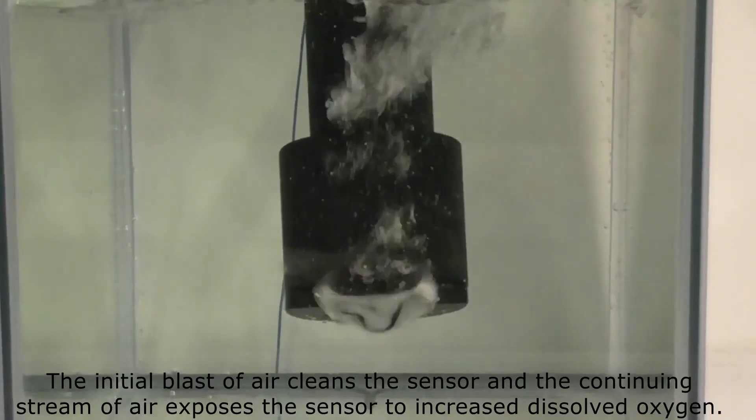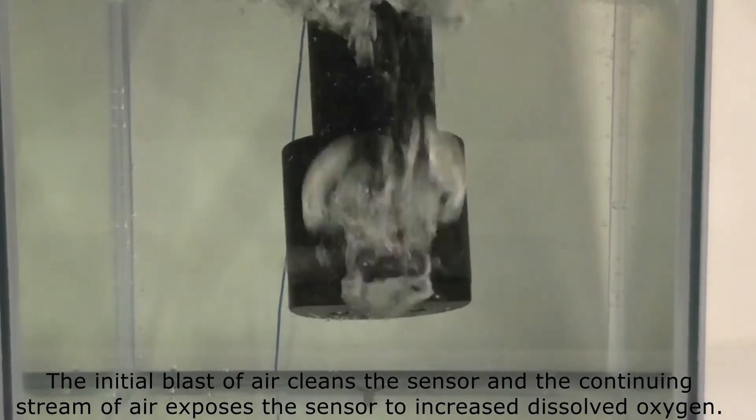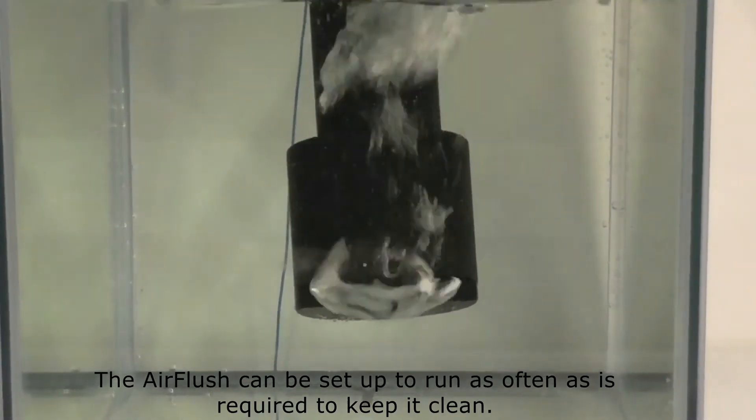The initial blast of air cleans the sensor, and the continuing stream of air exposes the sensor to increased dissolved oxygen. The air flush can be set up to run as often as is required to keep the sensor clean.